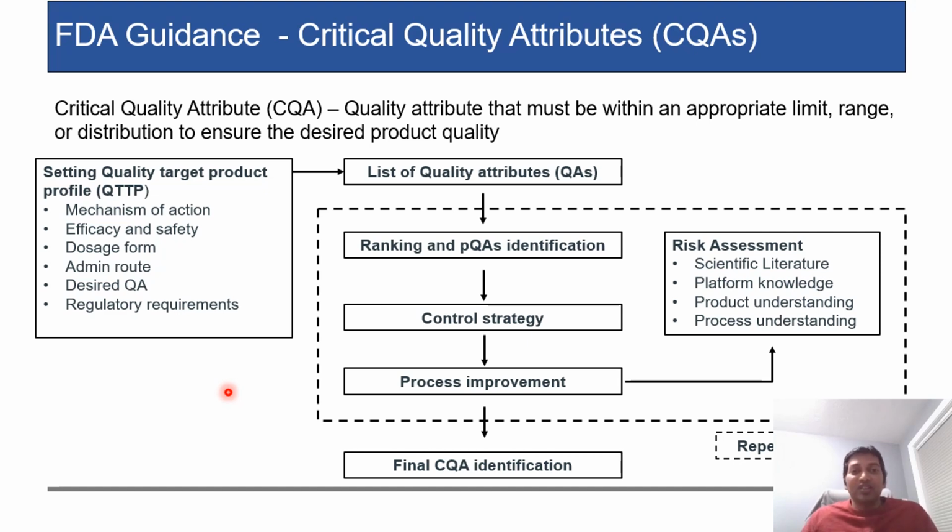So you understand all these factors, and then you define a control strategy. One example of a control strategy: let's consider you have a product, and it works at a specific formulation buffer pH or salts, and you want to check, if I change any of these attributes, how does this product behave? So you go ahead and do some of these control strategy studies, and really define and understand the product. Is there a big change in the product, or is it not really affecting the product?